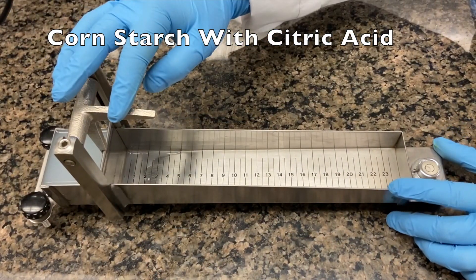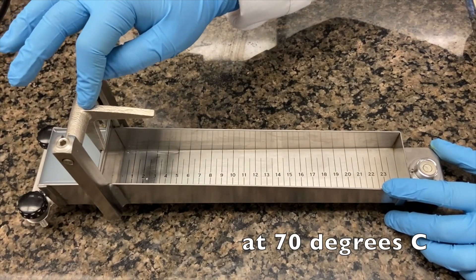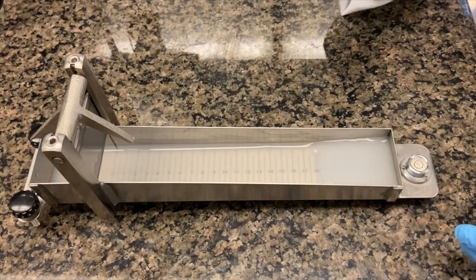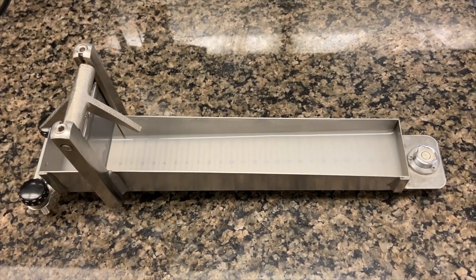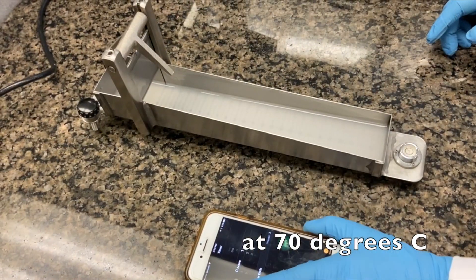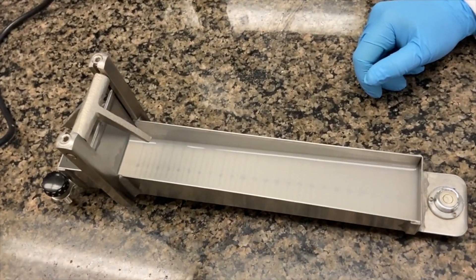This is the cornstarch plus acid sample. The first temperature is 70°C — starting the Bostwick for one minute. After a minute, this is the reading of the cornstarch plus citric acid.